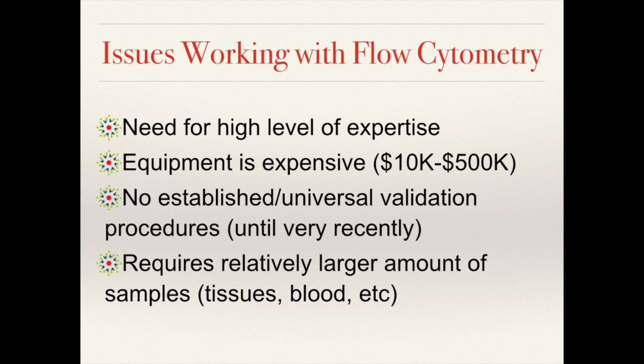There have been no established or universal validation procedures until very recently, so there are a lot of homebrew experiments, but none that are validated or qualified by the FDA. Another issue is that it requires a relatively larger amount of sample as opposed to other common assays that use serum or plasma in very small quantities.